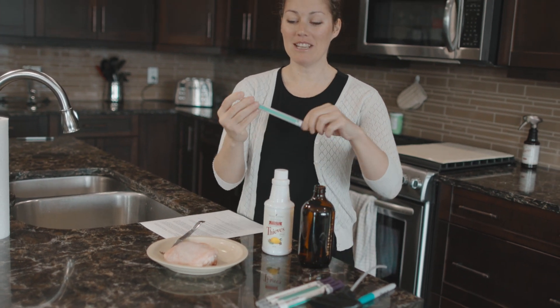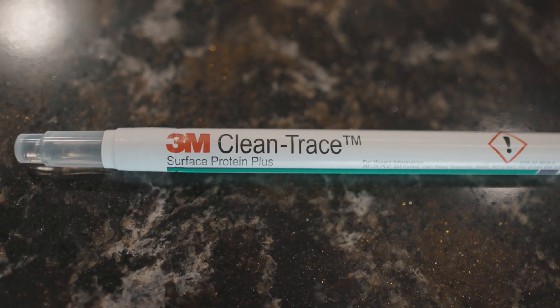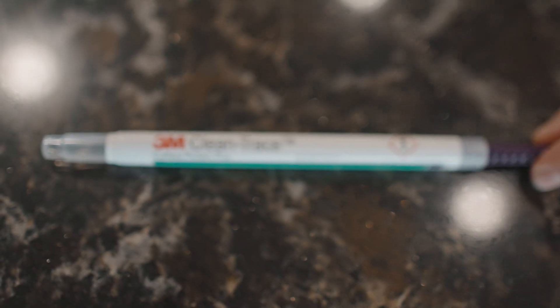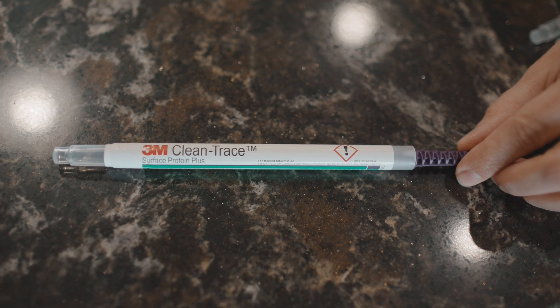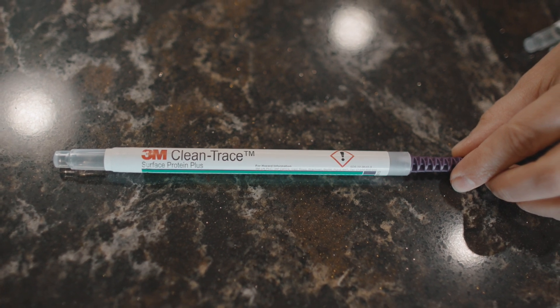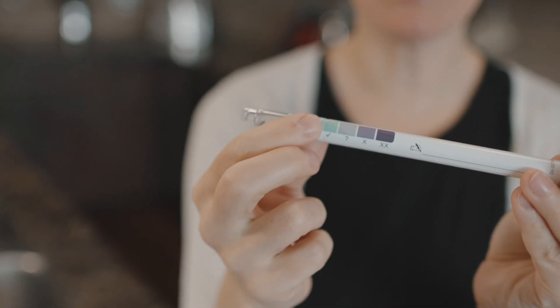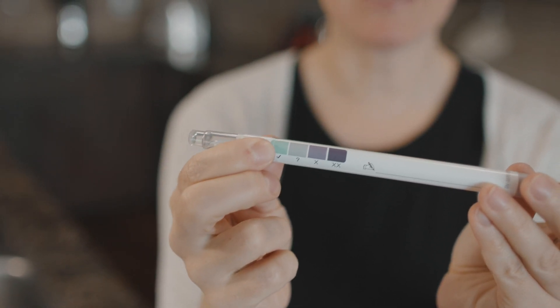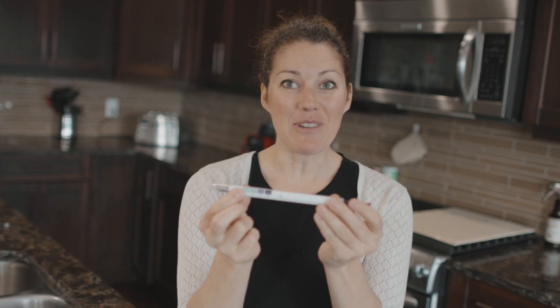We have these 3M Clean Trace test swabs, and this is the key right here. These swabs are for testing cleaning effectiveness. If you want more info, just Google '3M Clean Trace surface protein plus swabs.' Green means a surface is clean — it hasn't detected any proteins. Purple means it has detected proteins.